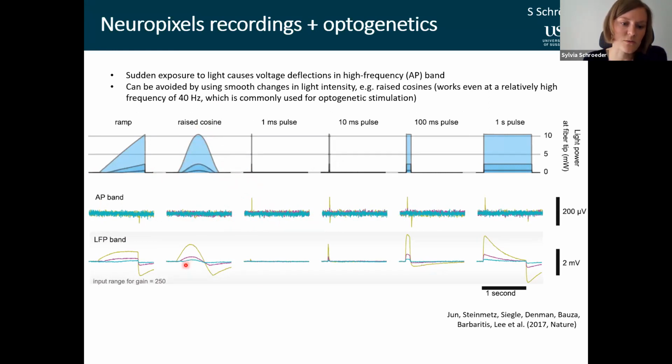Of course, you do have deflections in the low frequency bands. But if you're interested in spikes, then you don't need to worry about this, or it's a way around these artifacts.